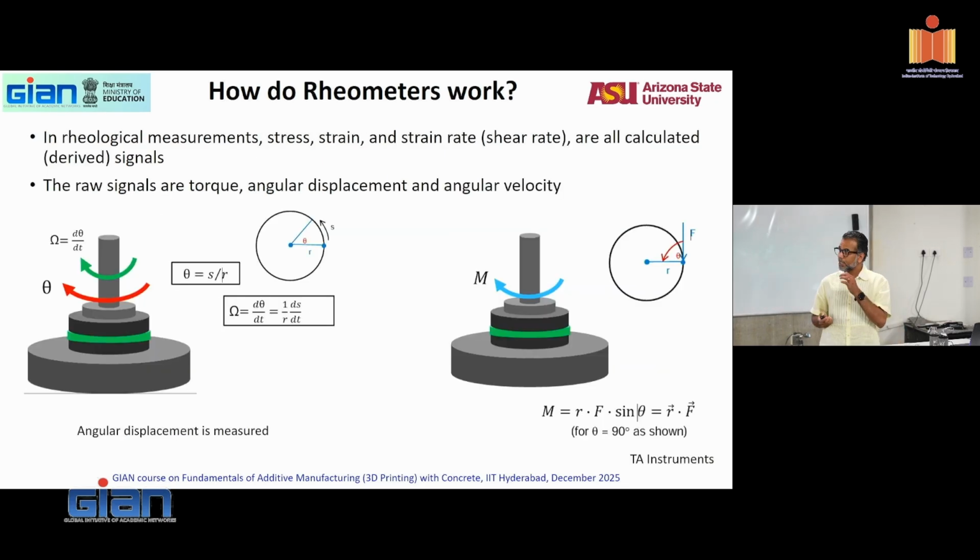Now, how do they work? Stress, strain, and strain rate are what we want. They are all calculated or derived signals. The raw signals are torque, your rotational force, angular displacement, and angular velocity.